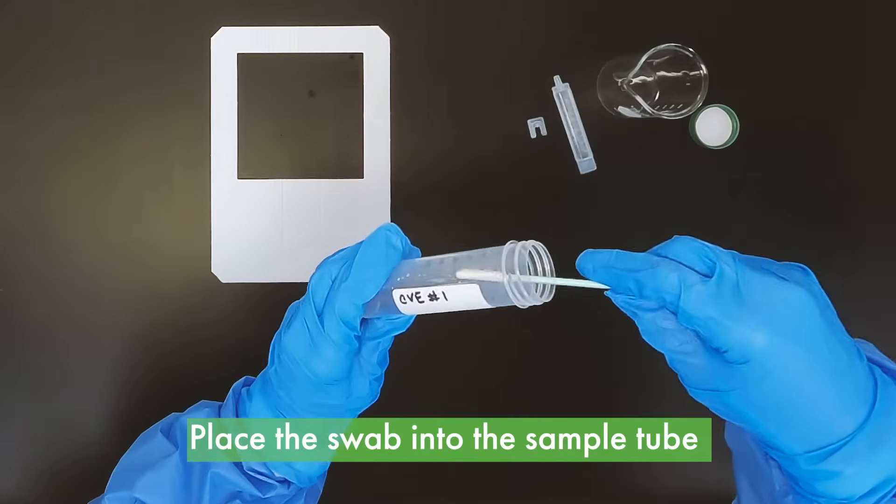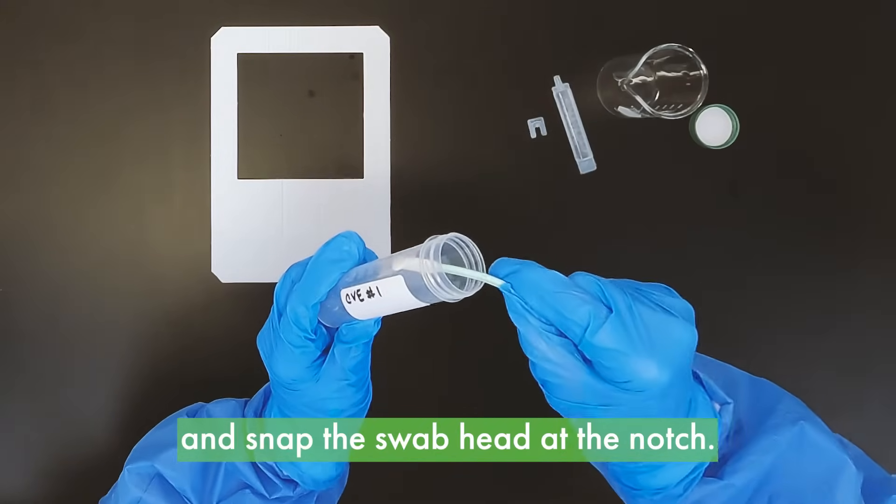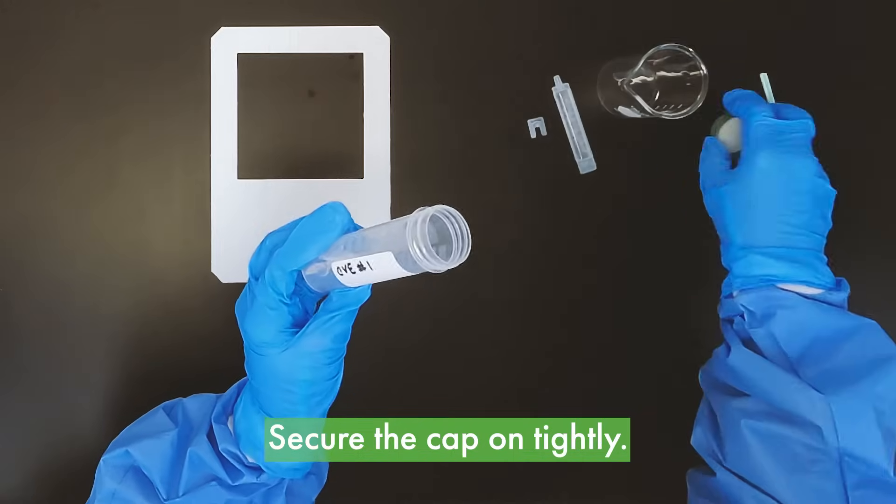Place the swab into the sample tube and snap the swab head at the notch. Secure the cap on tightly.